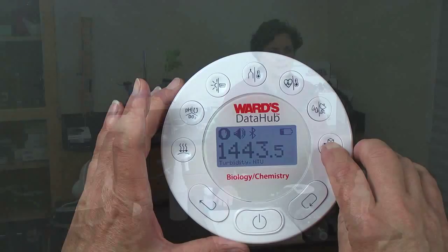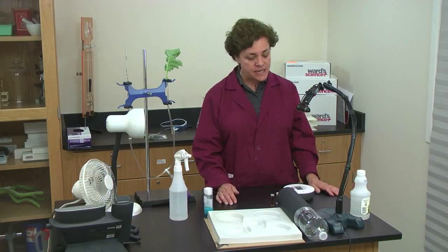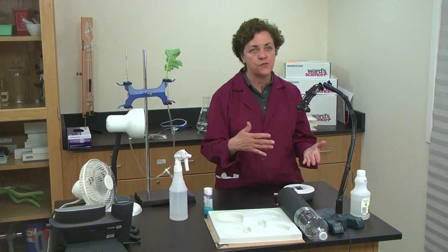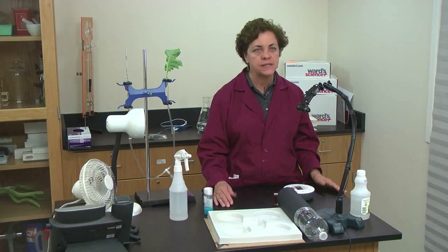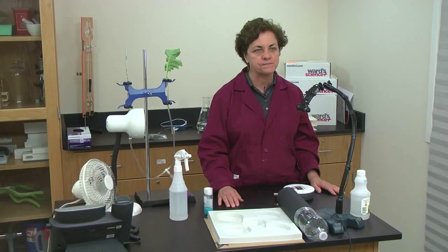So you can use a colorimeter, the ambient temperature, so what is it like on the outside, and you can test the pH, because some of the things is testing the enzyme for different pH buffers. You can test the pH and have them work with different pHs for the inquiry. And you go to the next slide.